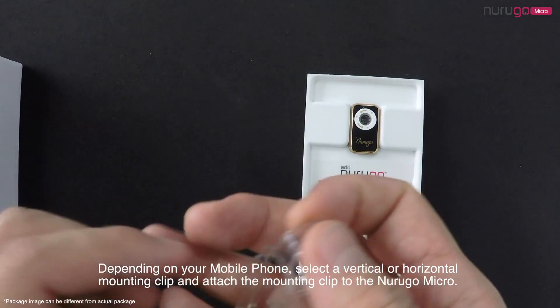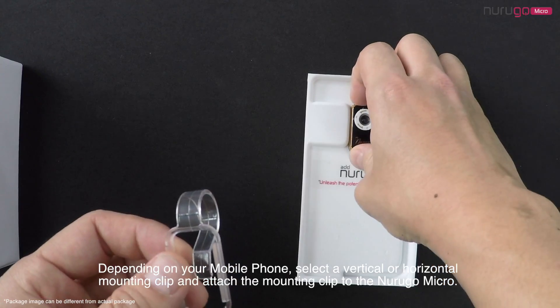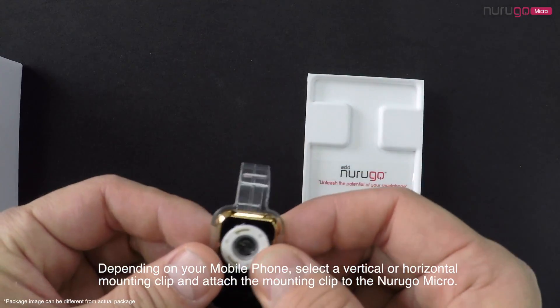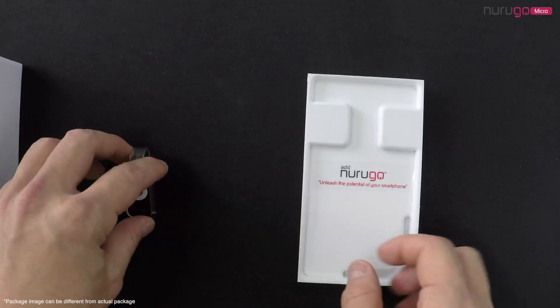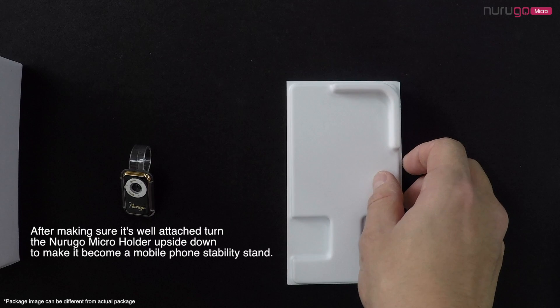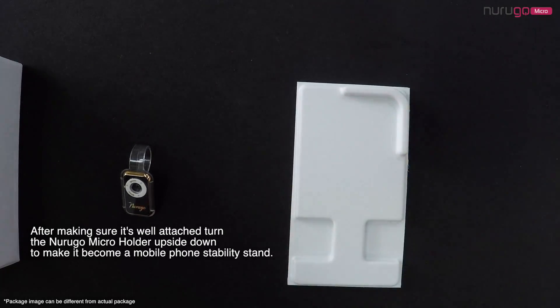Depending on your mobile phone, select a vertical or horizontal mounting clip and attach the mounting clip to the Nurugo Micro. After making sure it's well attached, turn the Nurugo Micro holder upside down to make it become a mobile phone stability stand.